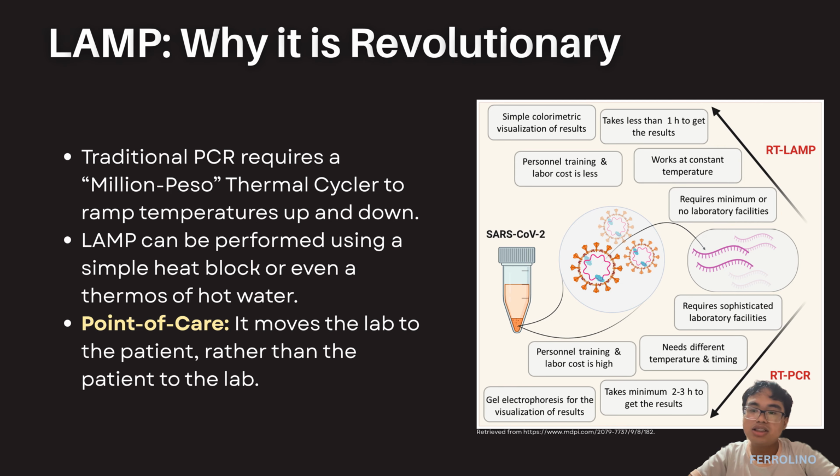The thermal advantages of LAMP are quantified in the comparison chart. RT-PCR requires high-precision thermal cycling, whereas LAMP maintains a constant temperature, enabling the use of simple heat blocks or insulated water baths. A critical biochemical byproduct of the LAMP reaction is the production of large quantities of magnesium pyrophosphate, which causes visible turbidity.